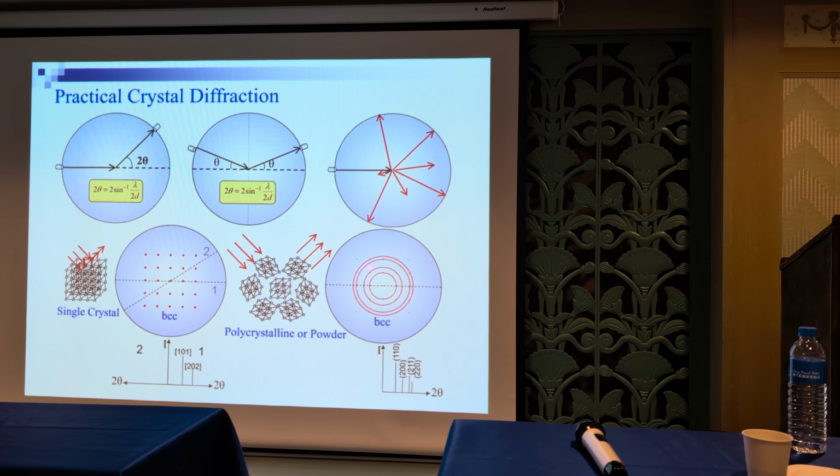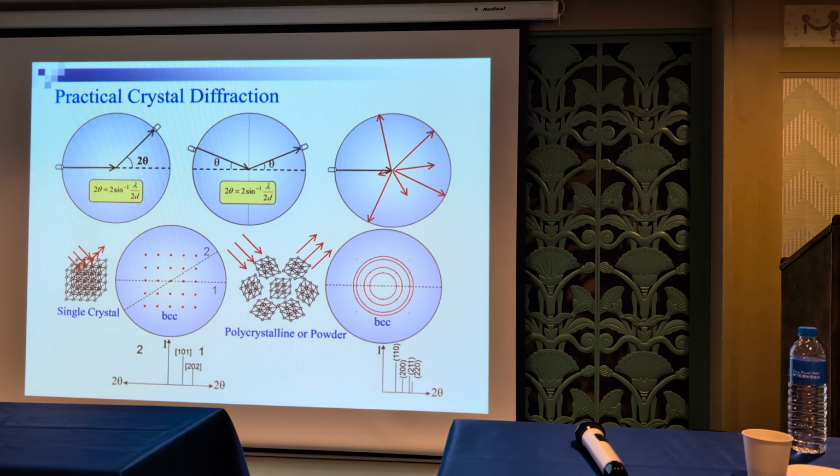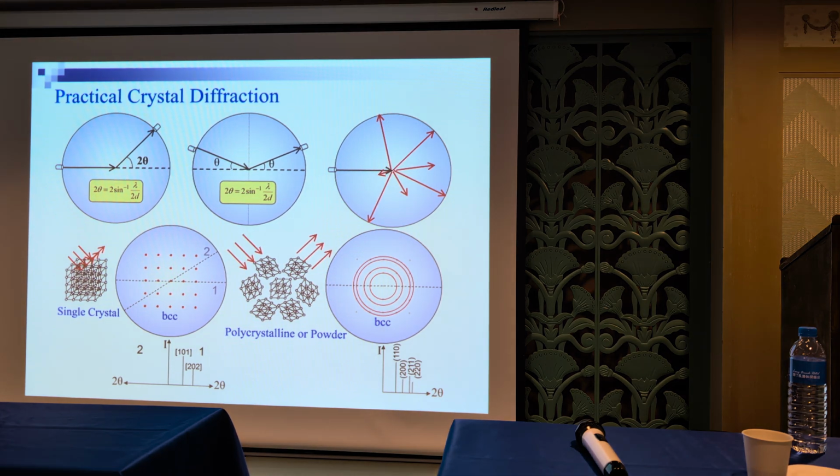And if your sample is not well prepared, like the powder, it will give you some spots within the ring. Typically, you can find this phenomenon from the TEM image. So be careful if you want to do powder diffraction experiments. Make sure that your powder is fine enough.